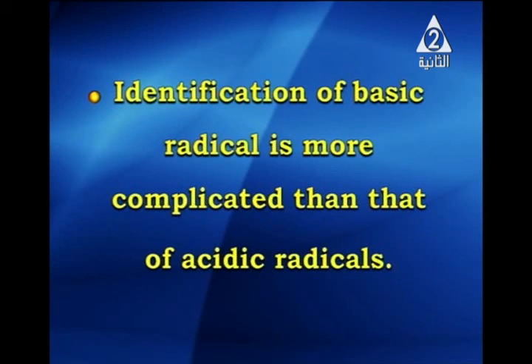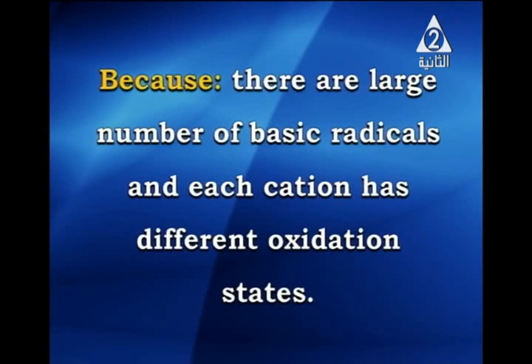Identification of basic radicals is more complicated than that of acidic radicals. The answer is that there are a large number of basic radicals and each cation has different oxidation states.